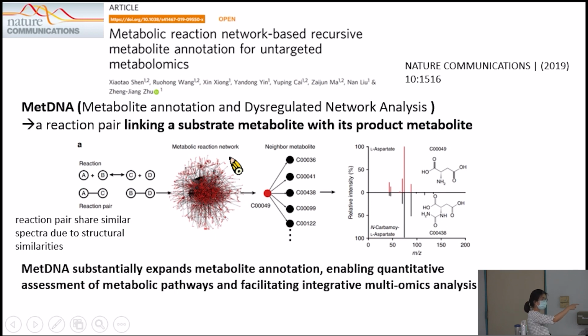So that is reflected in the data. That is the interpretation, not that one compound will only have one peak, because one compound may have multiple components inside.